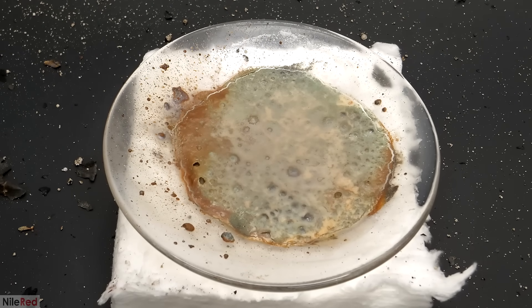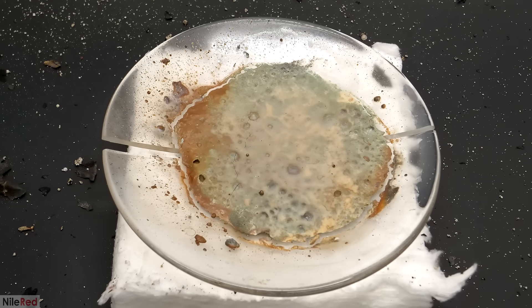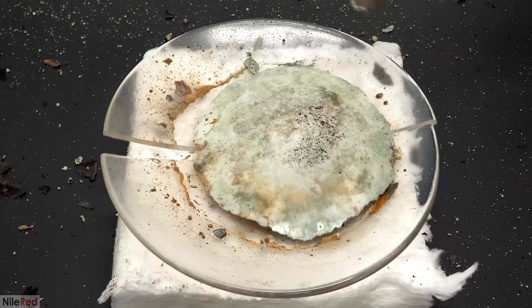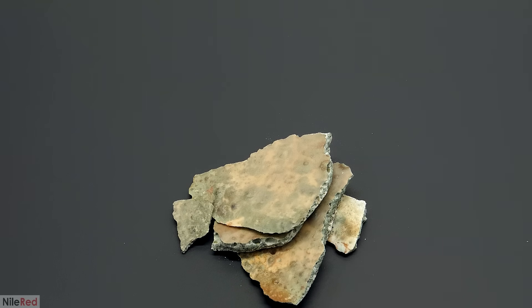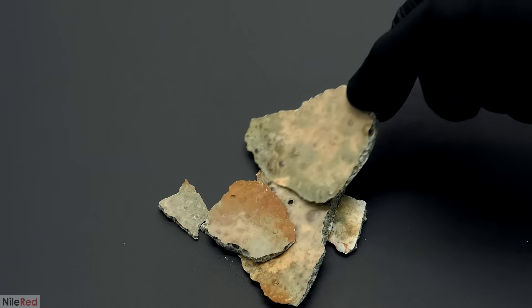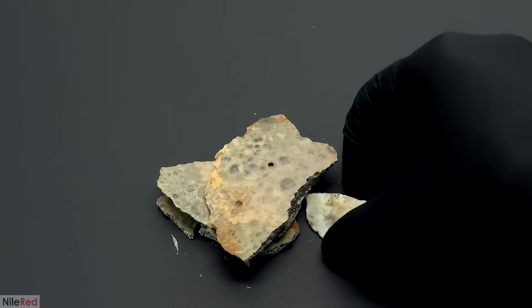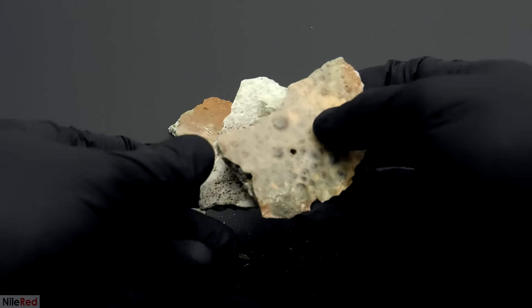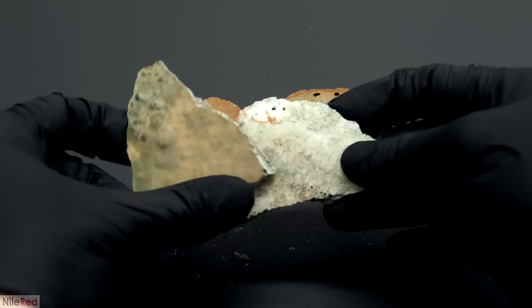As it cooled, it changed colors a bit, and it also cracked my dish, but I pretty much expected that to happen. It separated pretty easily from the glass, and it was relatively fragile. It felt and sounded very similar to porcelain, which I thought was interesting. As I said before, I think it was made mostly of sodium sulfate, along with some manganese dioxide, and maybe some chloride salts.